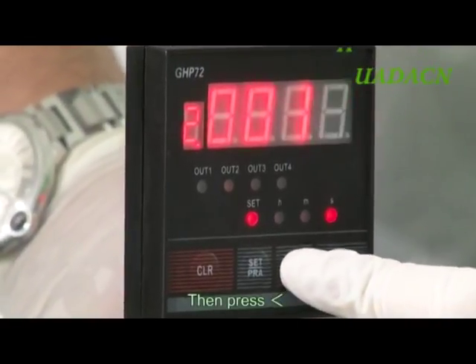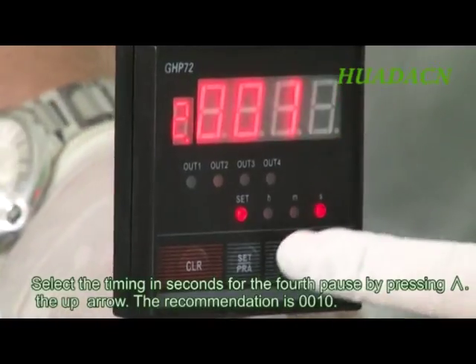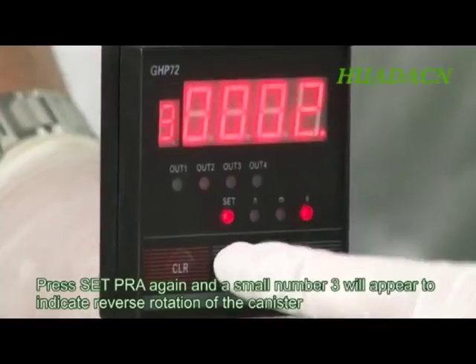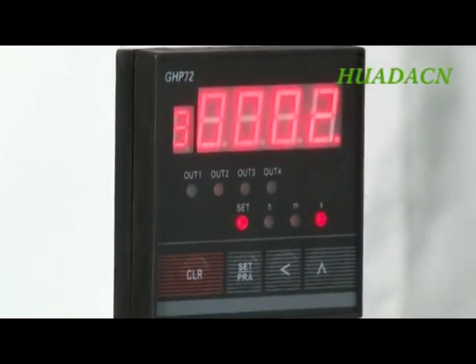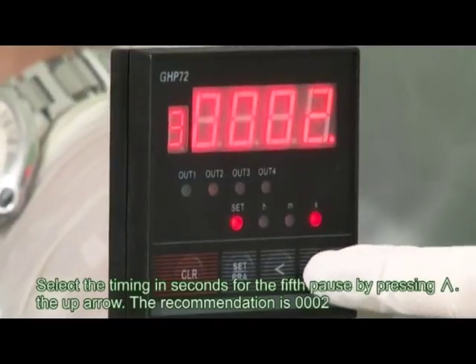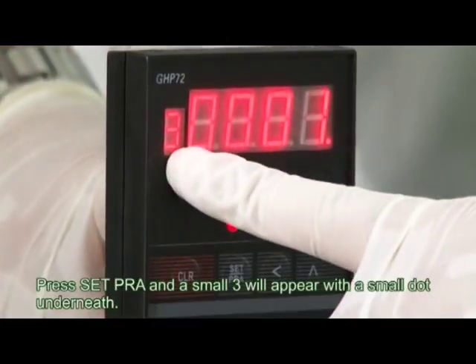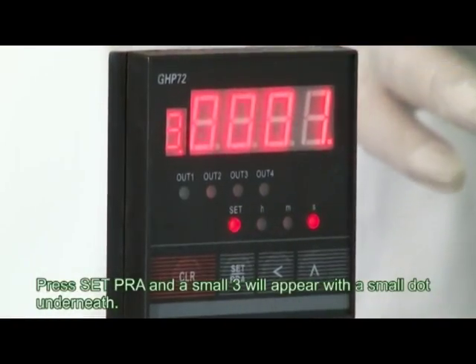Then press the left arrow. Select the timing in seconds for the fourth pause by pressing the up arrow. Press Set Pra again and a small number three will appear. Then press the left arrow. Select the timing in seconds for the fifth pause by pressing the up arrow. Press Set Pra and a small three will appear with a small dot underneath.